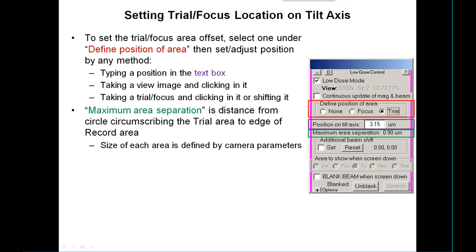To adjust the position — the displacement along the tilt axis — you select to define the position of one of the areas, trial or focus, and then you have several options. You can type a position directly into the text box, or you can take a view image and click in it to set the currently defined area out at that position, or you can take a trial image and either click in it or shift it to where you want it to be. This will not shift the whole system — it will just shift the position of the trial along the axis when this option is activated.